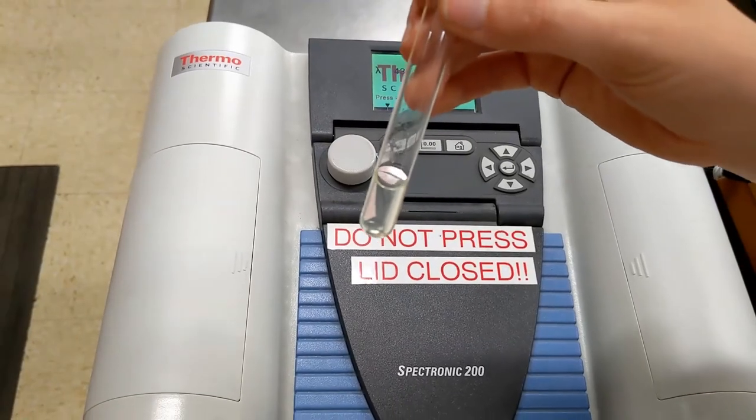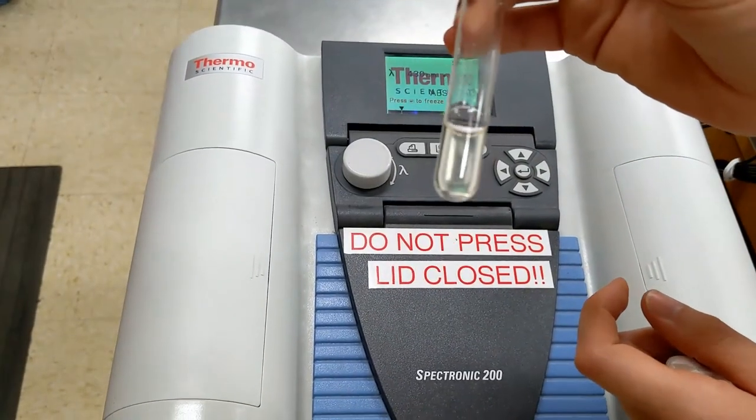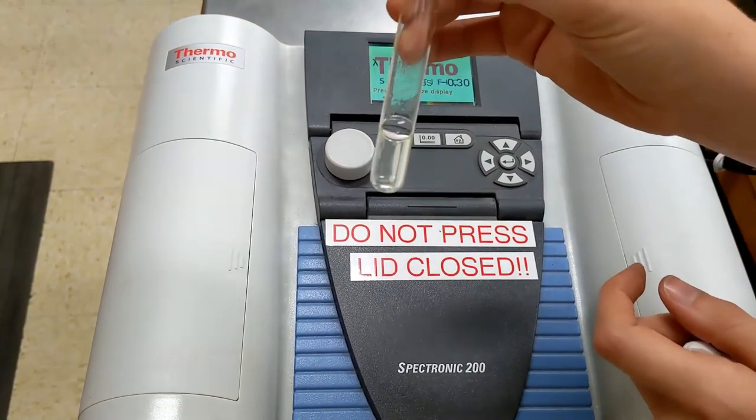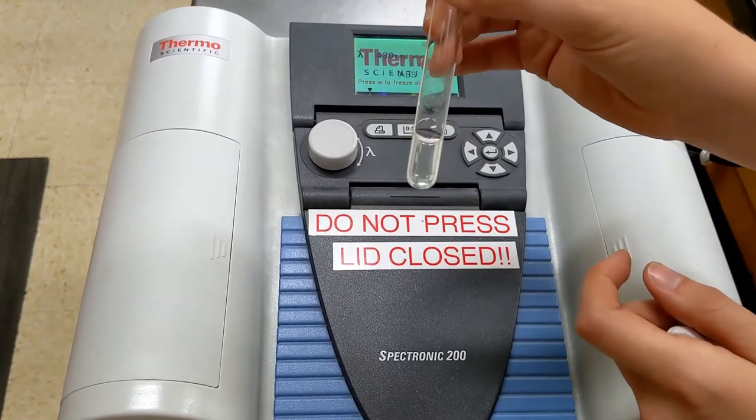Now we know there is color present here. We saw the number given by the spec, but look at how clear this solution appears. You cannot determine how yellow it is by the naked eye, which is exactly why we need to use the spectrophotometer.